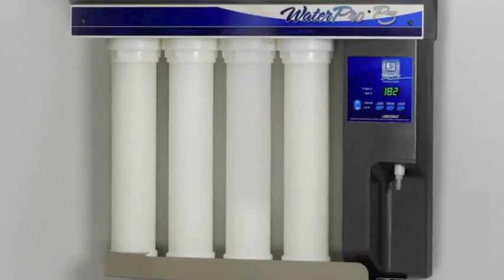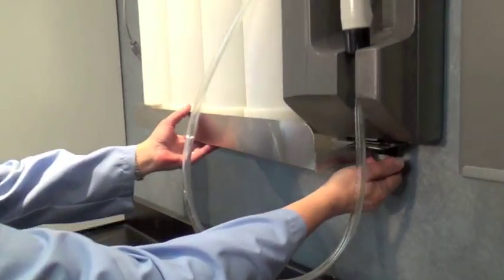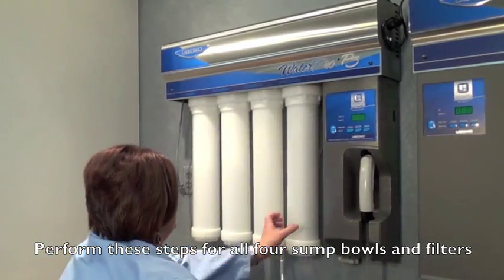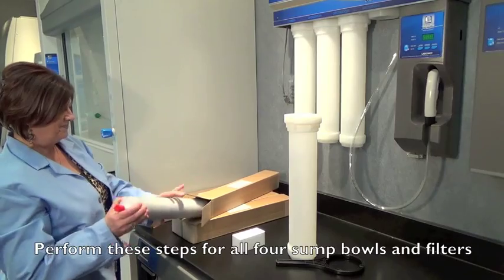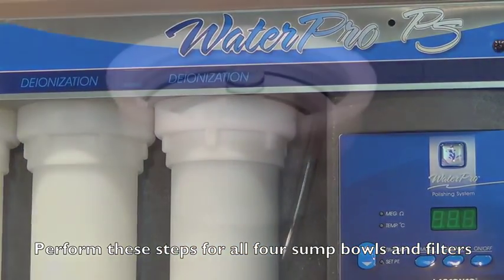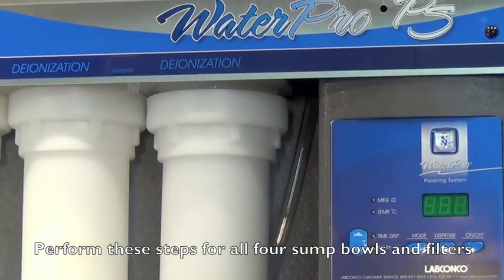To change the filters, do the following: turn the feed valve off, press dispense to relieve system pressure, unplug the unit from the electrical outlet, and remove the drip pan. Remove the four polypropylene sump bowls by placing the spanner wrench as high as possible around the bowls and unscrew each bowl by turning clockwise. With a twisting motion, install filters as indicated by the names on the front panel above the bowls. Check each cartridge to ensure the two black O-rings are seated properly into the sump top. Wetting of these O-rings will aid in installation. Carefully thread the bowls back into position and hand tighten only to seal the O-rings.